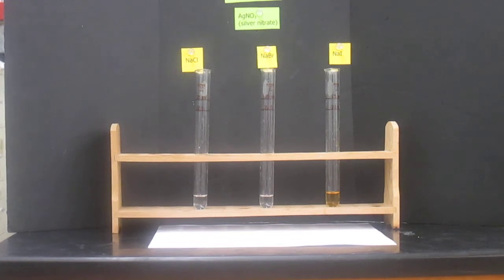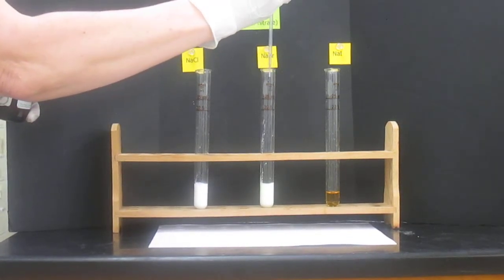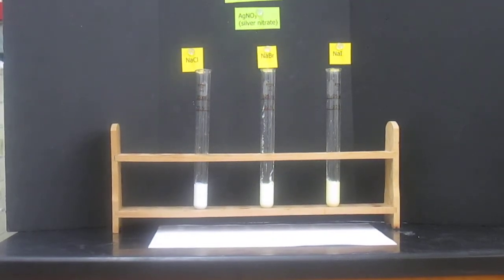As you see them left to right, they are labeled for you: sodium chloride, then sodium bromide, then sodium iodide. The chloride and bromide are clear, and the iodide has just a little bit of an orangish tinge to it. Now you should be able to see the different silver salts that were created.